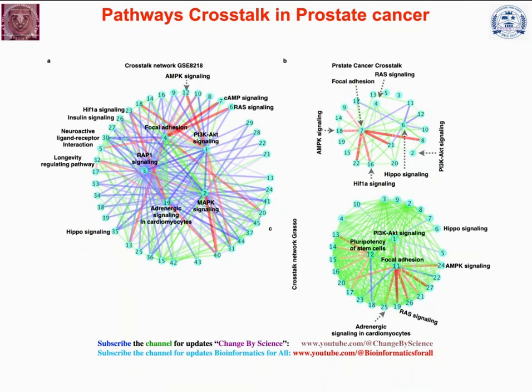then here you can see all those 5 pathways are more or less present here, which means that irrespective of the data set, these pathways are promoting the maximum pathway crosstalks. So in case you have a good analysis, then irrespective of the data set, the final conclusion should remain the same.